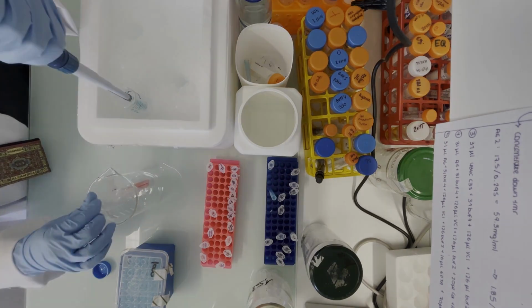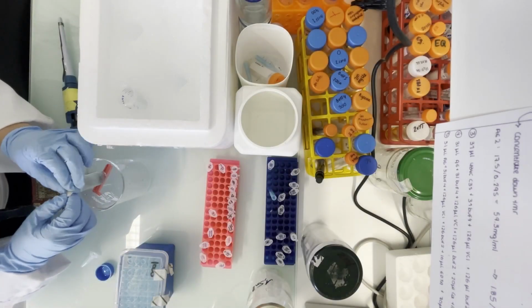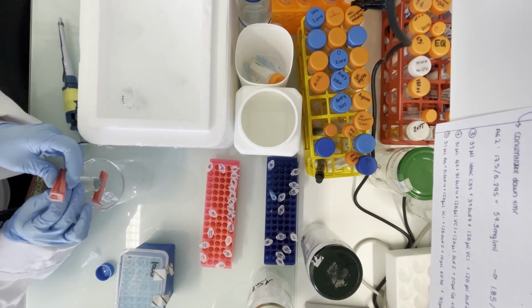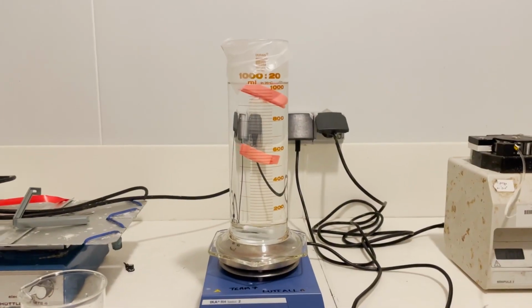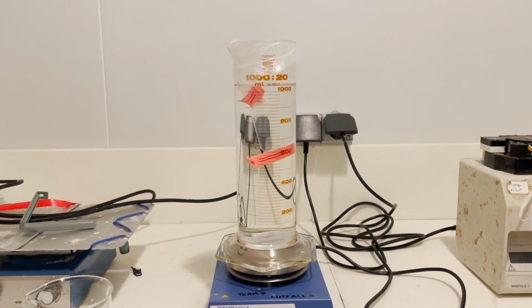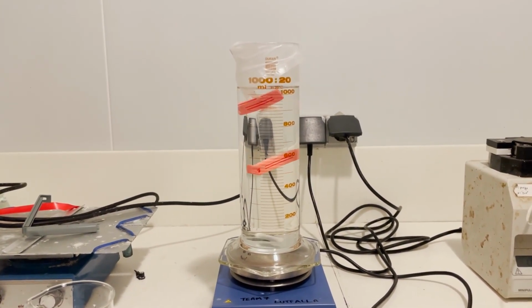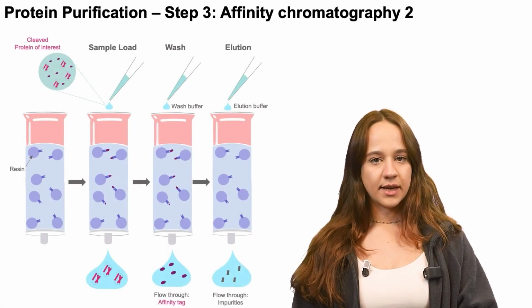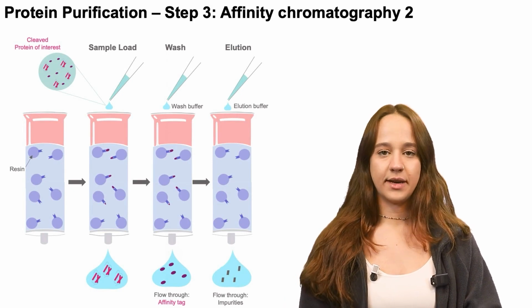As the protease is less active in the presence of divalent cations, we perform the cleavage simultaneously with a dialysis in a buffer containing EDTA in order to remove any cations that may be present in the buffer. The cleavage is done overnight at 4 degrees Celsius to ensure that all protein sample is cleaved. On the next day, we recovered the cleaved sample and pass it through the nickel column again.